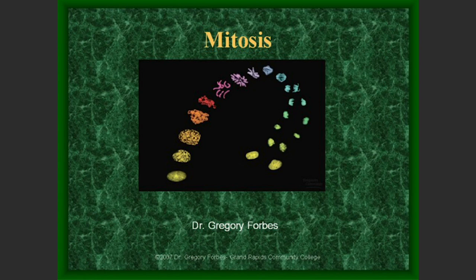What we're trying to accomplish in this presentation, in fact, with the student performance objectives, the SPOs for this lab, is to not have you become an expert with every aspect of mitosis, because that's going to happen in lecture. Our goal really here in lab is just to have you understand how to identify the different stages of mitosis and then know a couple features of the cell itself.